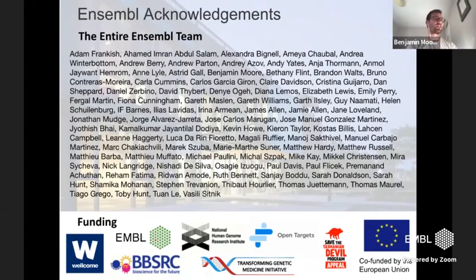So Emma's asking, are genomes in the Rapid Release site in progress towards being fully annotated and incorporated into Ensembl, or will they stay in the Rapid Release site? So the idea is actually, I'm not sure if you were here for this part of the presentation, but someone was asking about the division between Ensembl and Ensembl Genomes, so the vertebrates and the non-vertebrates.